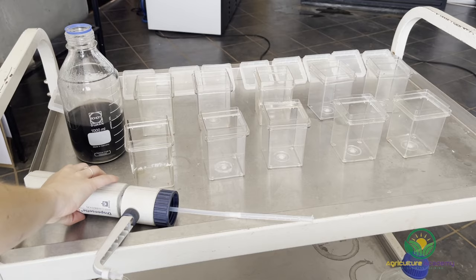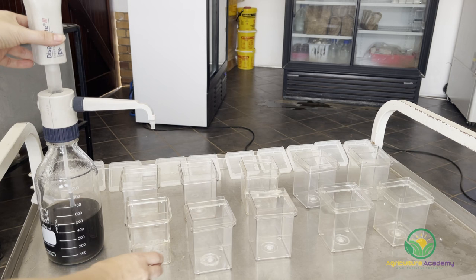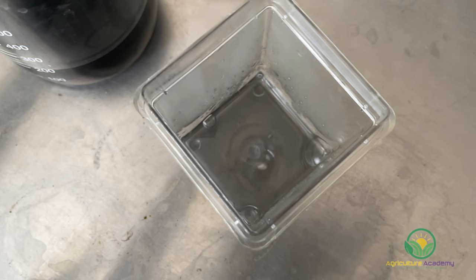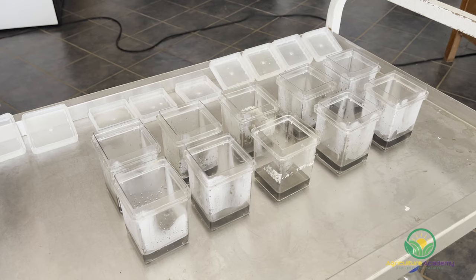With each pump, the dispenser releases 10 milliliters of solution. We pumped our solution into heat-stable plastic pots. Glass honey pots are a great alternative for home use. Each pot should contain between 30 to 50 milliliters of medium. The pots were sealed with their lids and readied for autoclaving.